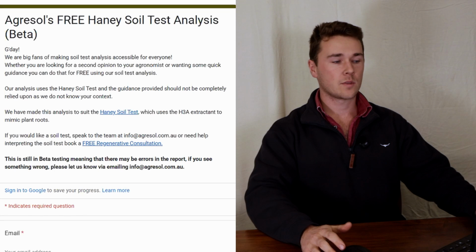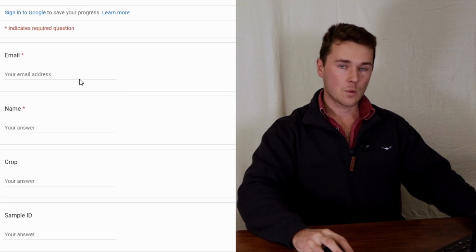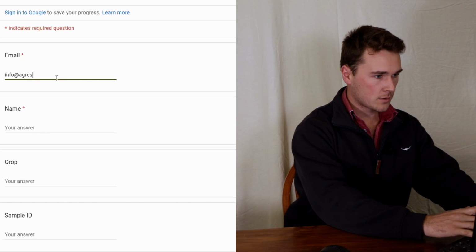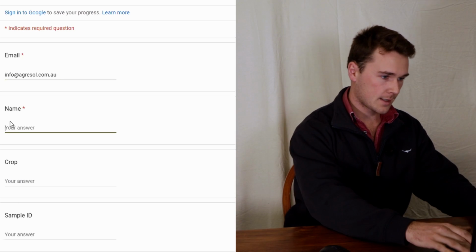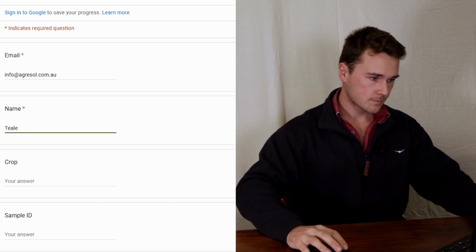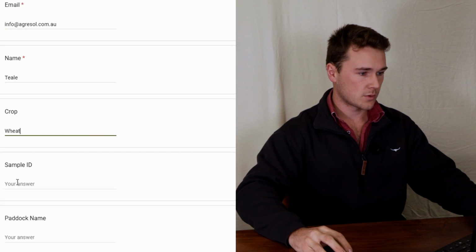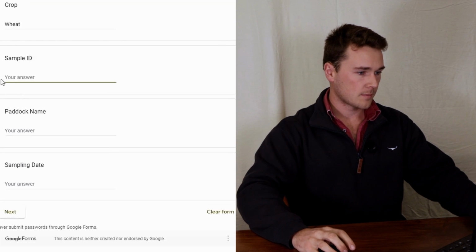So once you arrive on the Haney soil test analysis, you'll see this form here. What you'll do is you'll need to enter in your email so that we know where to send it. Enter in some metadata, so for example your name, what crop. That doesn't necessarily matter, but it's good to keep an idea of what you're going to put in.